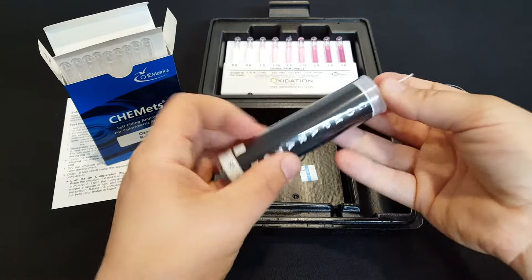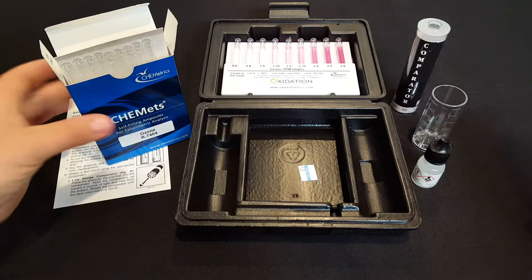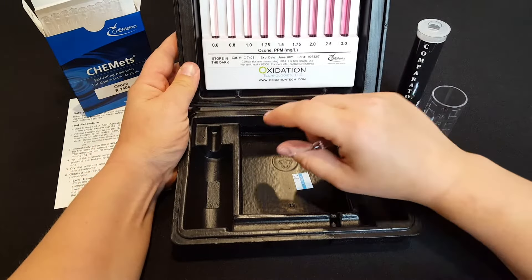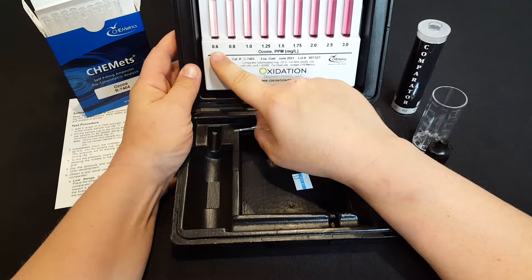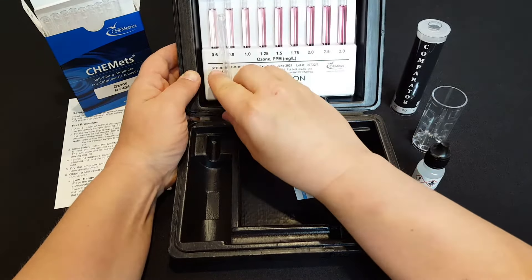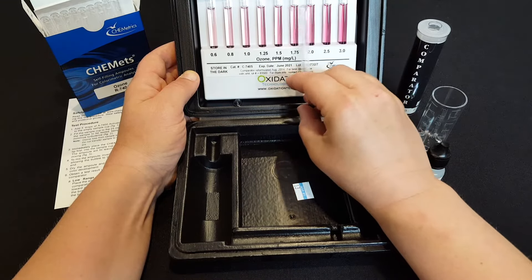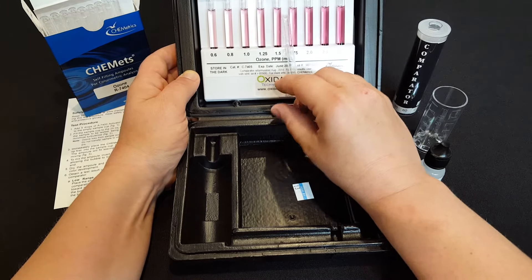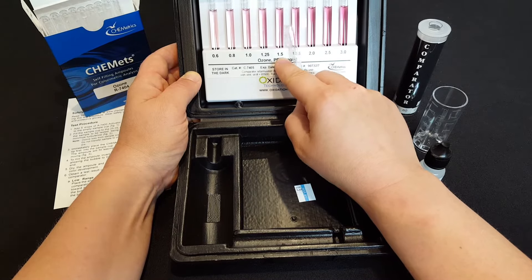If your pink color is darker than anything on the first comparator, you move up to the other comparator included in the kit. This one picks up where the other left off — it starts at 0.6 parts per million and goes up to 3 parts per million. You hold the ampule up to it and whichever color it matches most closely is your level of dissolved ozone. For example, if it matches this color pink, you would have 1.5 parts per million dissolved ozone.